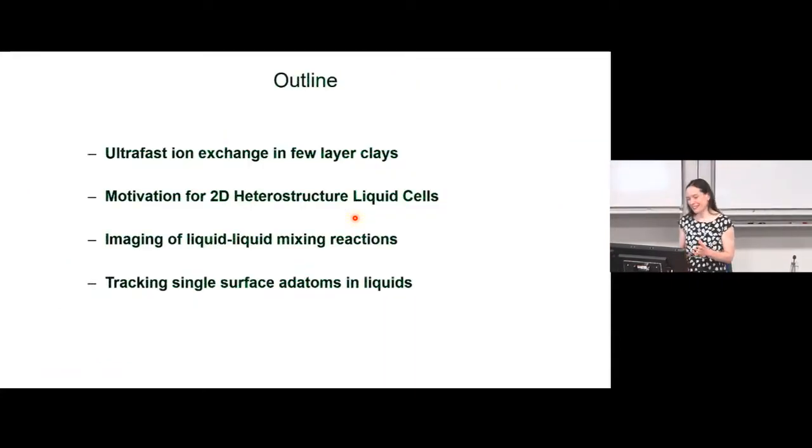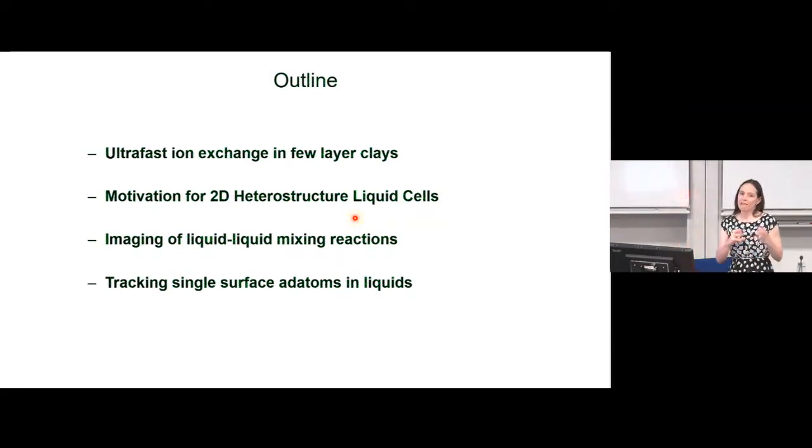So what am I going to talk about? In this talk, I'm first of all going to give you an example of some recent work which we did looking at a reaction that happens in liquid. And we've done the whole of this experiment ex situ, so taking samples that had been in liquid, drying them out, putting them in the microscope. I'm going to show you that because it demonstrates why we would really like to be doing this experiment in liquid in the microscope.